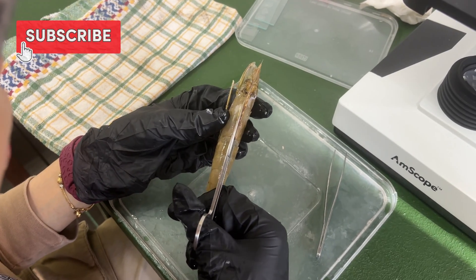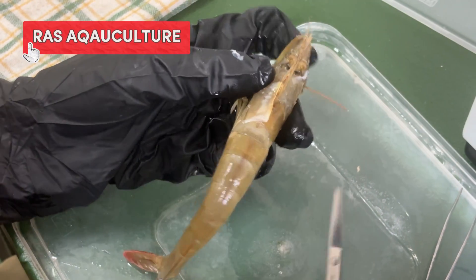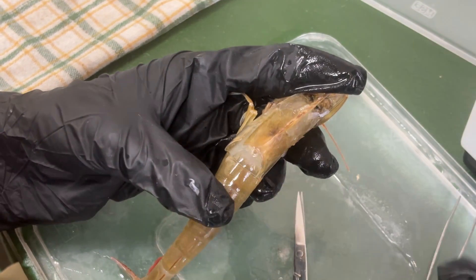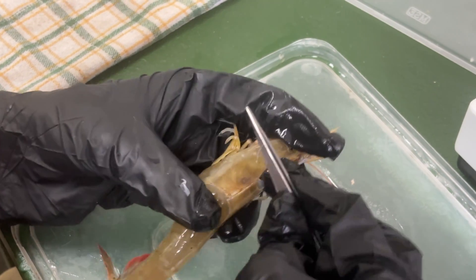Hi everyone, welcome back to RAS Aquaculture channel. Before starting shrimp farming, it's important to understand the shrimp itself. As a farmer, you must know the parts of the shrimp to manage health, growth, and breeding better. Today, we'll dissect a shrimp and learn about its internal organs.